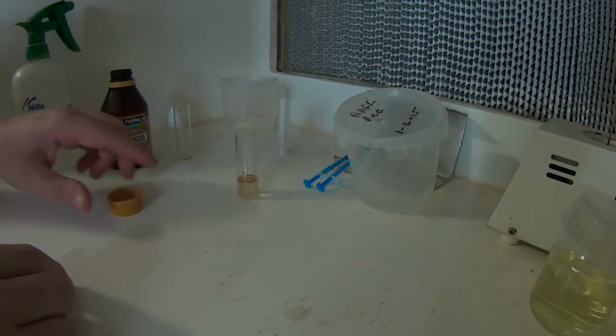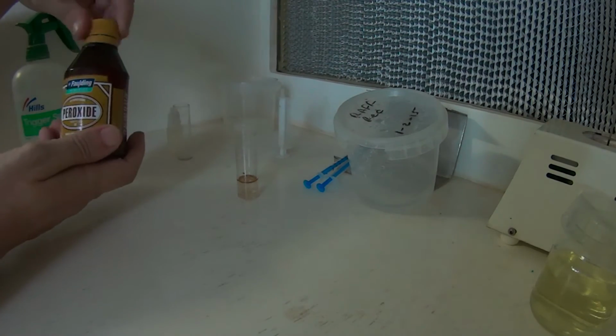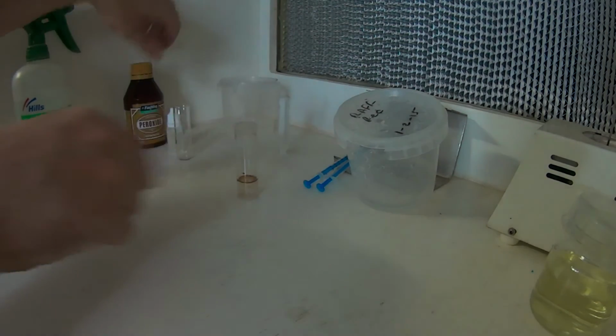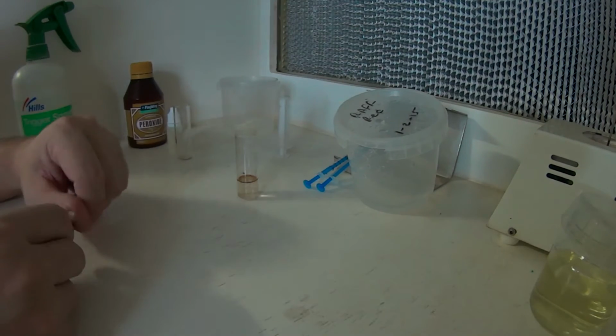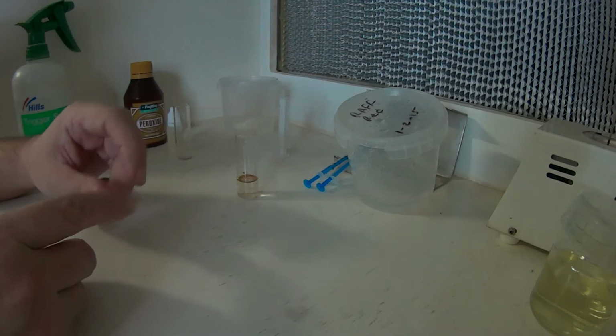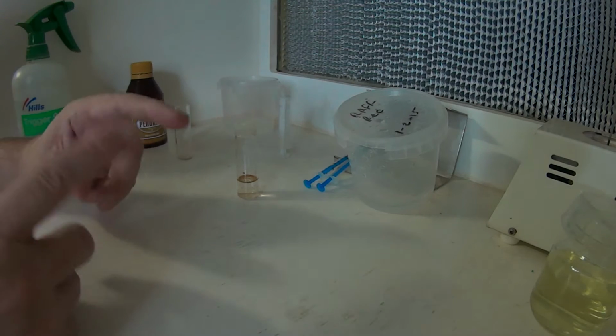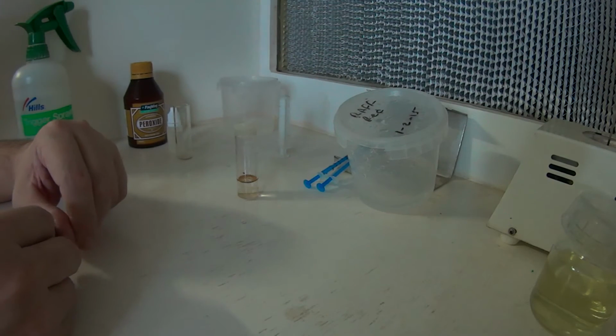The timing doesn't have to be exact. As I said, the good thing with using peroxide is once we add the seed to the media, we just simply add the liquid into the media. In the presence of fairly strong sunlight, the hydrogen peroxide will break down into water and oxygen, so there's no chemicals involved in it at all, really. So like I said, we'll let it sit for a little while and we'll come back to it.